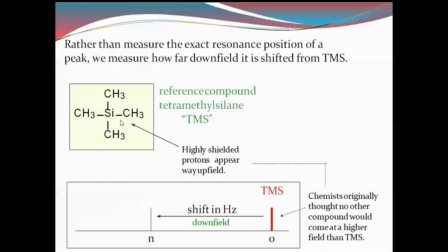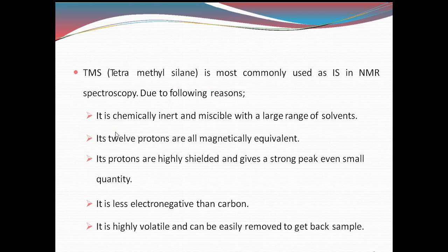This is the structure of tetramethylsilane, which is highly shielded. That's why it shows at the zero level. Zero is the initial point, and it can be taken as a reference standard. It always gives a uniform peak and does not show any fluctuations, and it is a highly shielded compound. That's why it is taken as a reference compound.